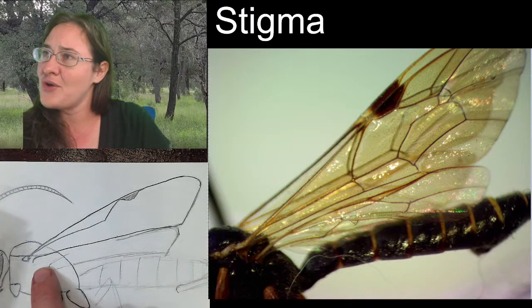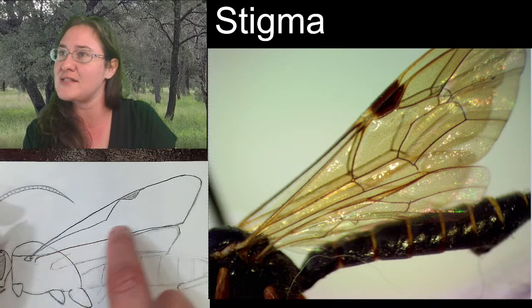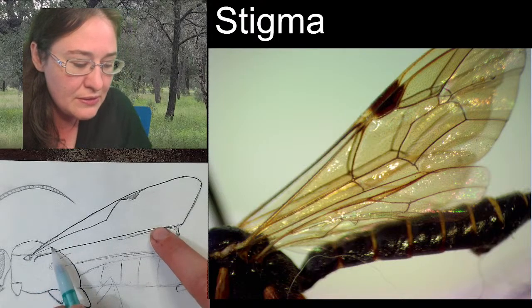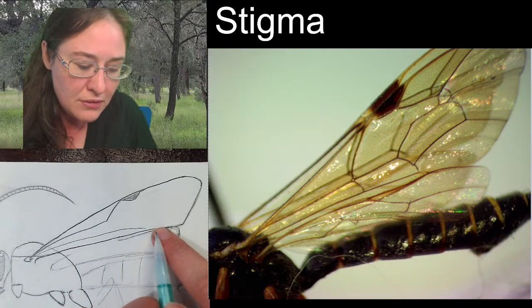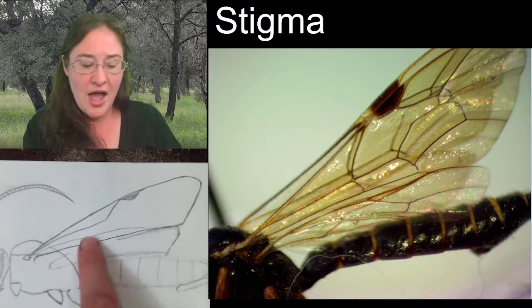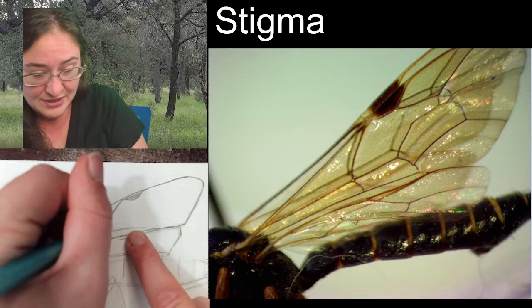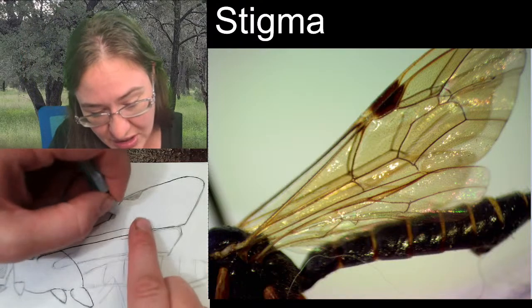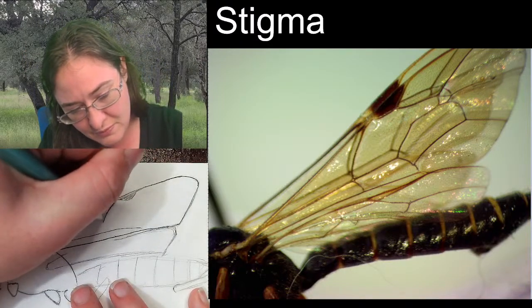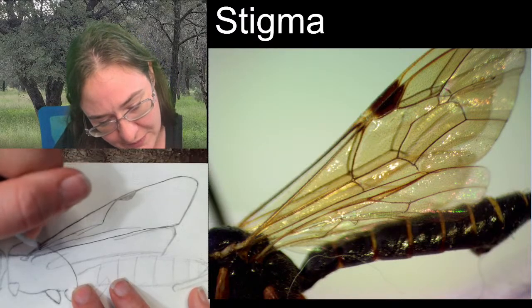And then you have an anal vein, and that's this third one coming off the base, and it's not going to go anywhere. It's going to just kind of end right about there. Now, this one continues. Let's see. We're actually going to make it a little bit longer, I think. Yeah, that's better.